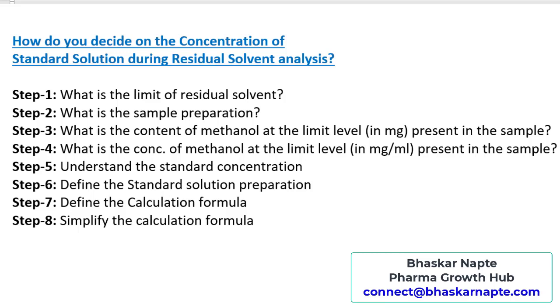Quantification is one of the objectives of an analytical experiment, and there are various ways to meet this objective. It has been observed that the external standard is widely used for quantification, and this is one of the most accurate techniques amongst the others.